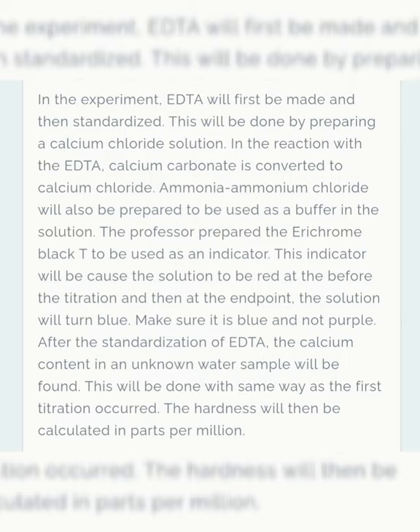In this experiment, EDTA will be first made and then standardized. This will be done by preparing a calcium chloride solution. In the reaction with the EDTA, calcium carbonate is converted to calcium chloride.